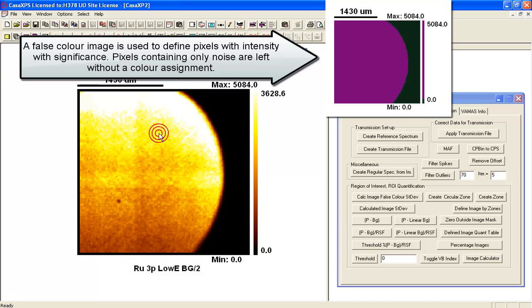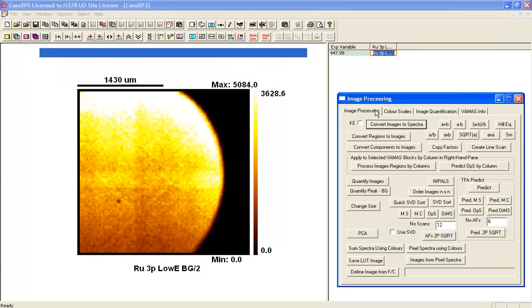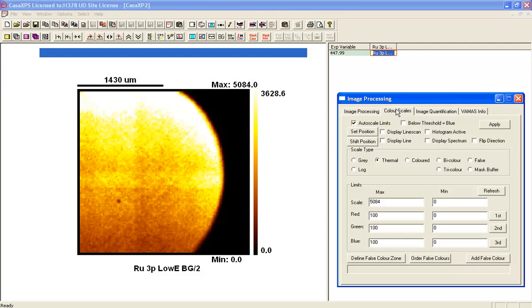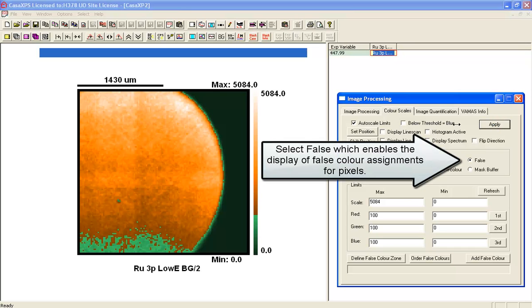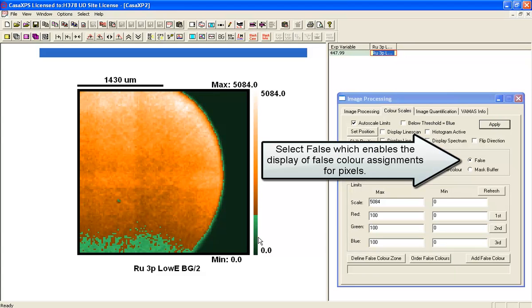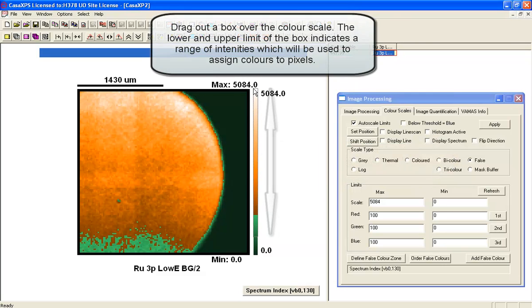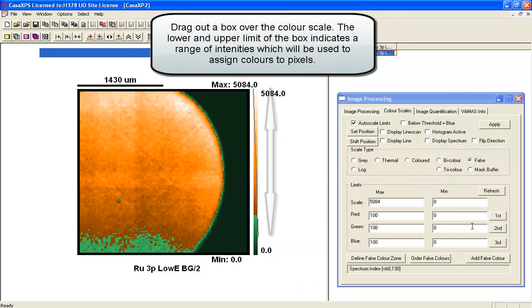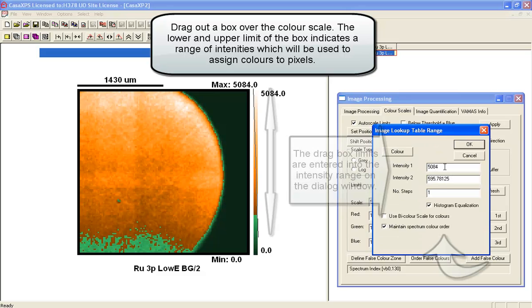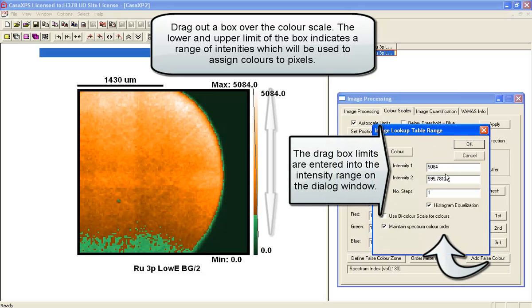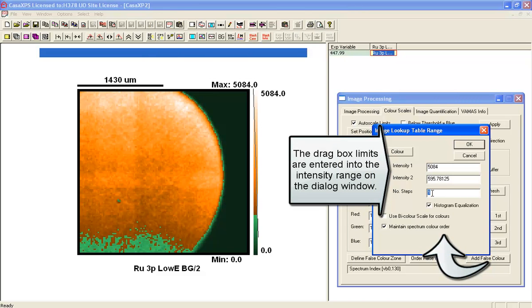And then we are going to create a mask that will highlight where the signal is. So if we go to the color scale, select the false color, and mark out using the color scale and dragging a box, a set of intensities are entered into the lookup table dialog window of colors that we are going to generate.